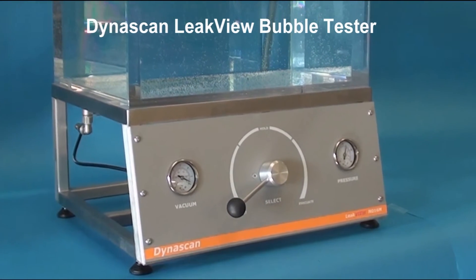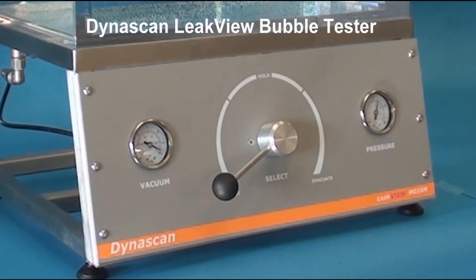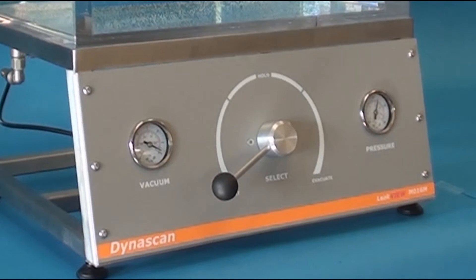Introducing the Dynascan Leak View, a budget vacuum leak detection system suitable for production and laboratory environments.